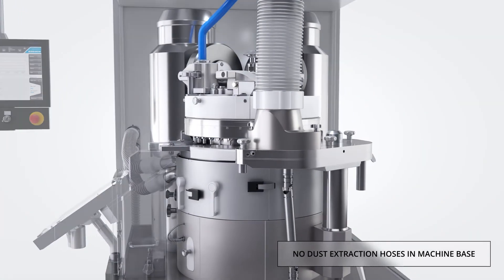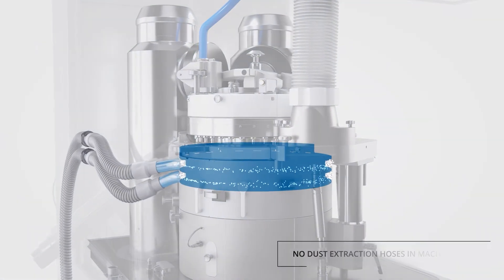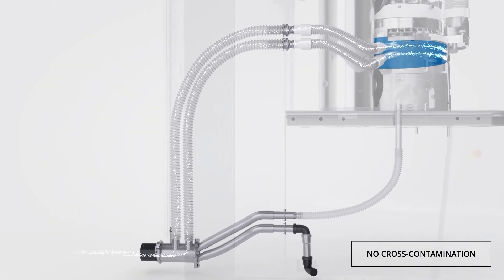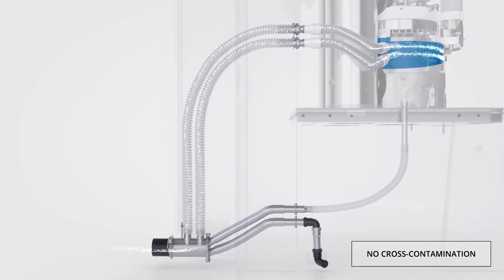The new concept for routing the dust extraction hoses through a dedicated chamber in the multi-function column at the rear of the machine permits full accessibility for dismounting and cleaning. As a result, the machine base is free of hoses and therefore not contaminated.